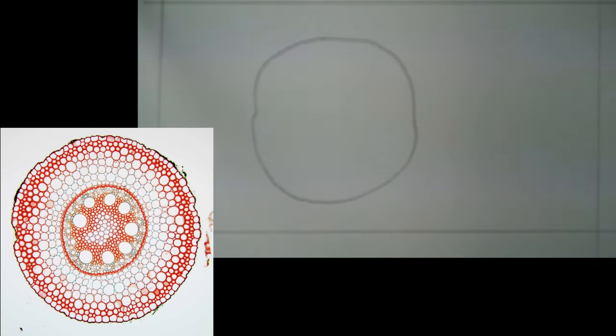Anyway, looking at the diagram now, trying to differentiate some tissues. The first thing I'd be looking for, with any kind of layers, is an outer layer. If we're talking an animal, it might have an epithelial layer, a skin, or in a plant it would be epidermis, basically just the plant skin. Looking at this one, I do think there is a single-cell outer layer. The main reason is the colour: the outermost layer of cells are very white, whereas the ones slightly in from that have stained a lot more red. That difference in staining is going to be a hint, partly for our tissues here too.